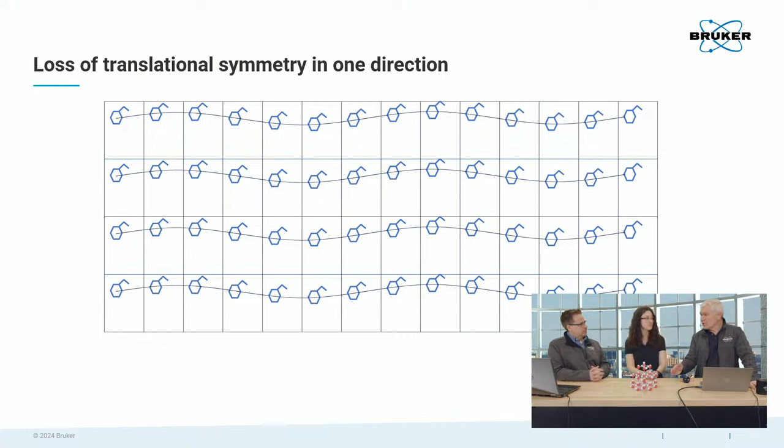And the long-range order actually destroys the short-range order, at least in this direction, because now you see you don't have translational symmetry anymore. If you go along the rows in the columns, you would still have. Mm-hmm. Worst-case scenario is you could have a modulation there, too.